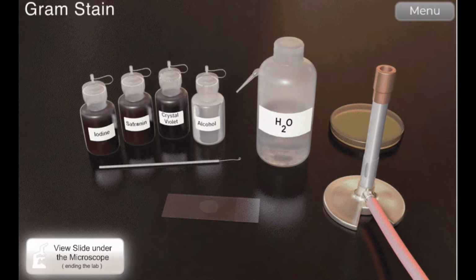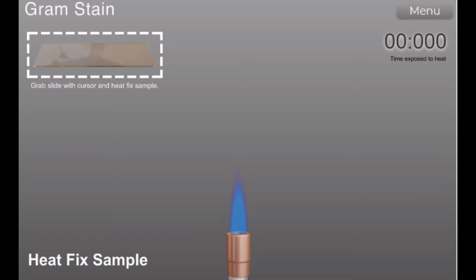we will start with heat fixing the slide. So we need to gently heat the slide 2 or 3 times through the flame.